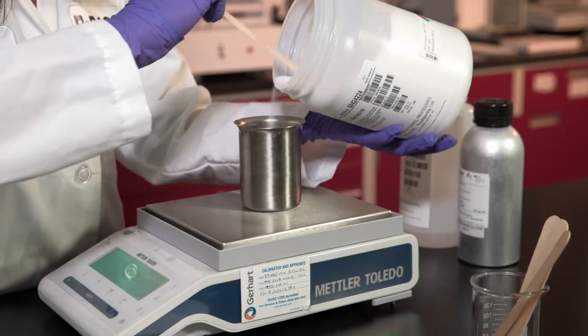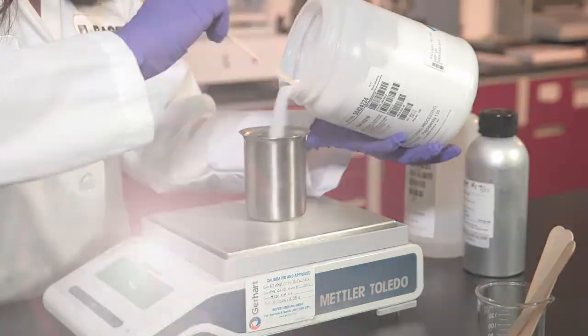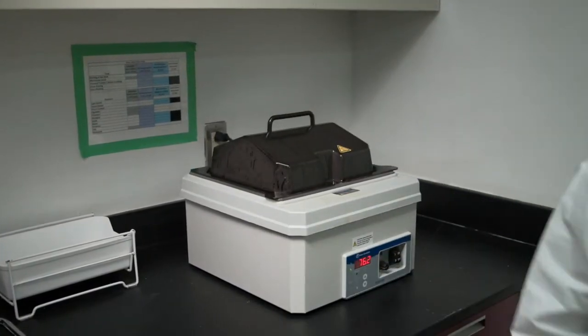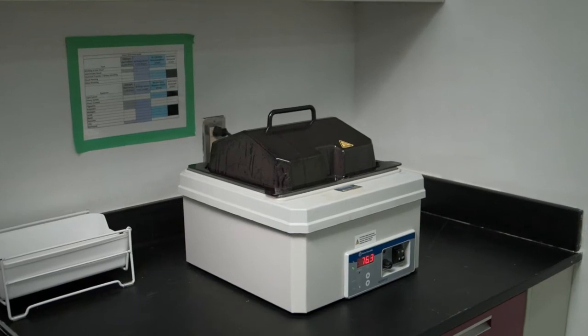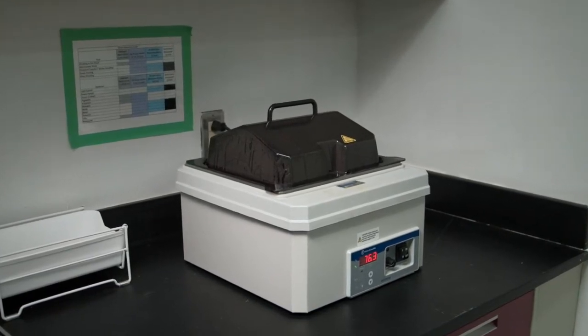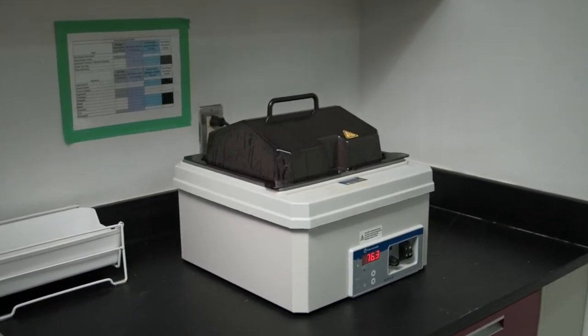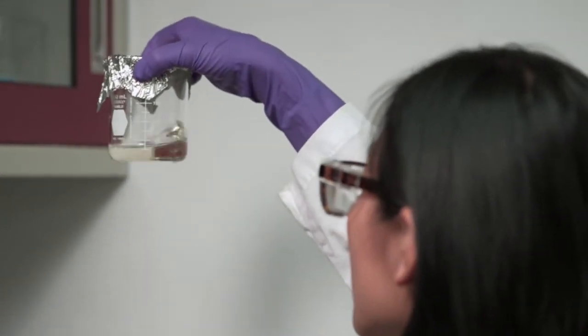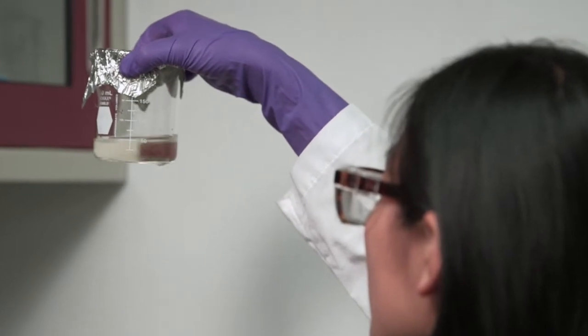PEG ointments are relatively easy to prepare and begin by heating formulation components so all products are liquid. It is important to limit heating time to as short of a duration as possible, particularly in the presence of oxygen.